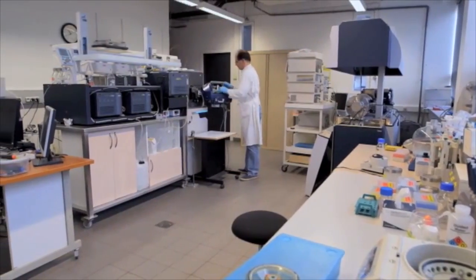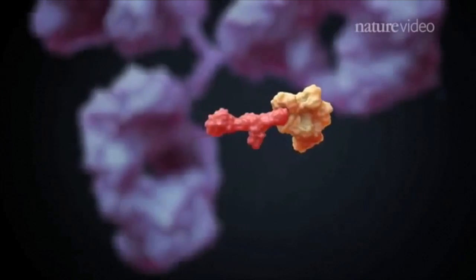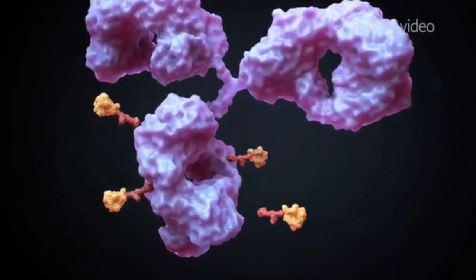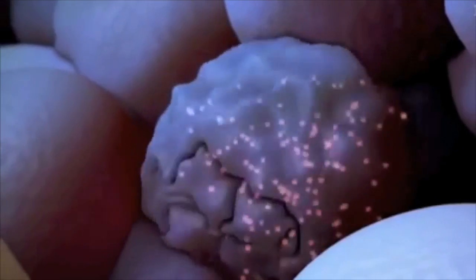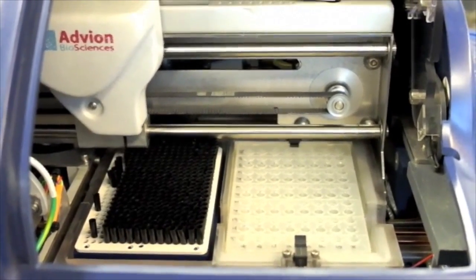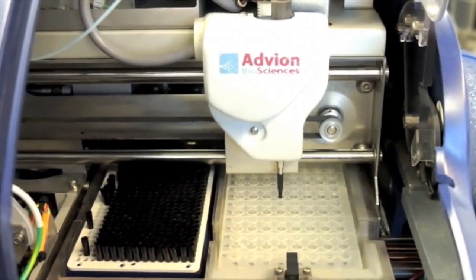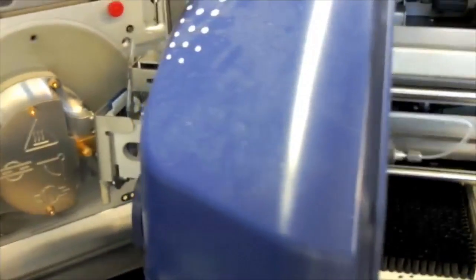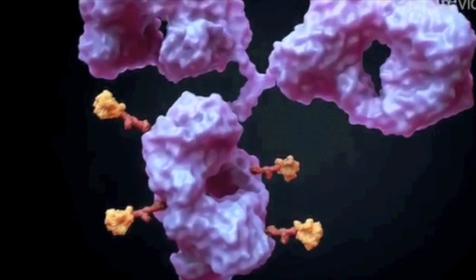Mass spectrometry is also widespread to study the structure and dynamics of therapeutic proteins like monoclonal antibodies that are foreseen as next-generation biotherapeutics to treat specific diseases like cancers. A particular application of mass spec is native mass spectrometry, performed in near-physiological conditions. This approach is routinely used in our lab for monoclonal antibody and related products characterization.